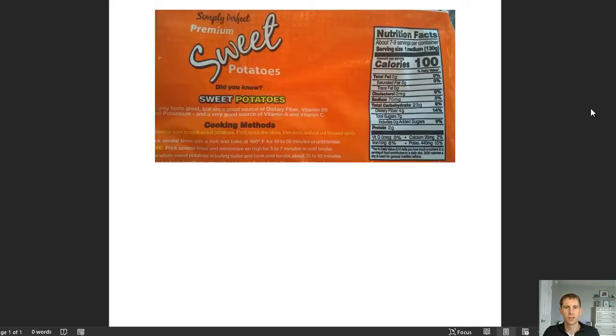Hello everyone and welcome to this special edition extraction of starch experiment. This experiment is a special edition because we're using premium sweet potatoes instead of the good old russet potatoes.